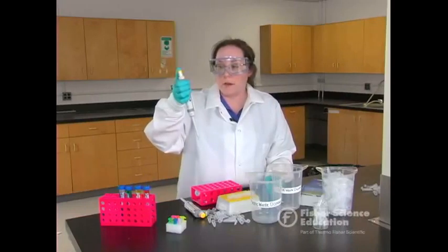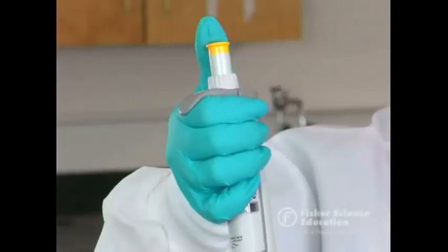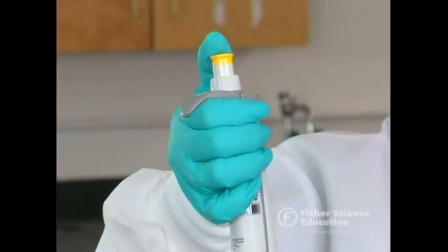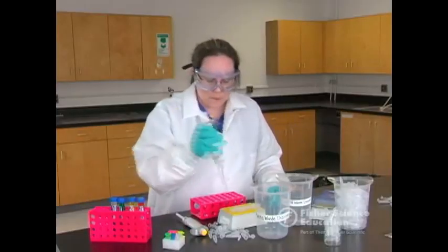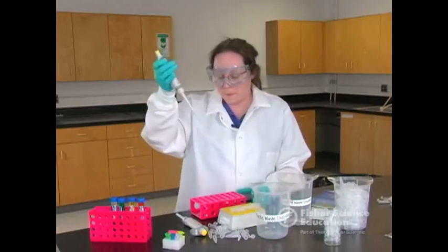And so you want to make sure that first stop is very well ingrained with your students. So I like to do a little bit of biotech exercise, thumb aerobics, and practice having them only go to the first stop up and down about 5 or 10 times so they get used to it. So the first thing is always use a tip on your pipetter.